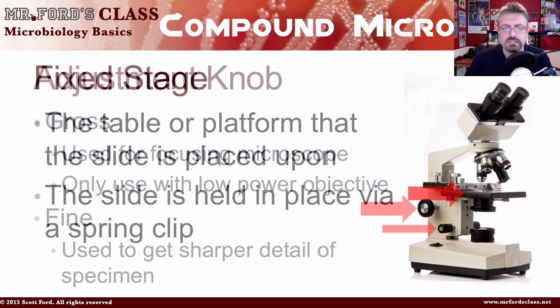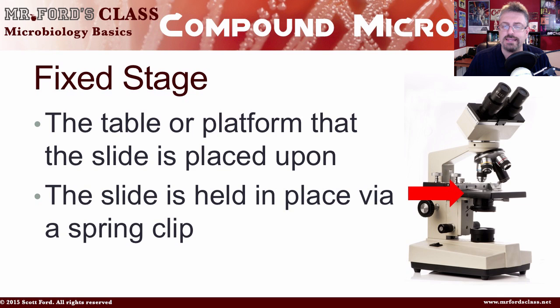The fixed stage is the table or platform where you place your slide. The slide is held in place via a spring clip on most microscopes. One story: while teaching anatomy in high school, a student thought you had to physically pull the metal clip over the slide, causing a grinding glass sound. The correct technique is to just place the slide down, gently release the spring clip, and it will secure the slide — don't force it on top.